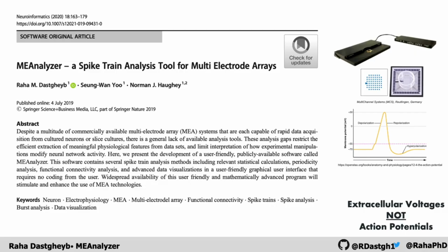They can measure acute or long-term responses under controlled conditions and are overall pretty wonderful and give you a huge amount of data. But then the problem is how to analyze it. Writing your own code is not accessible to everyone, and if you're a wet lab scientist, you shouldn't be limited in terms of the experiments you do just because you can't write code.